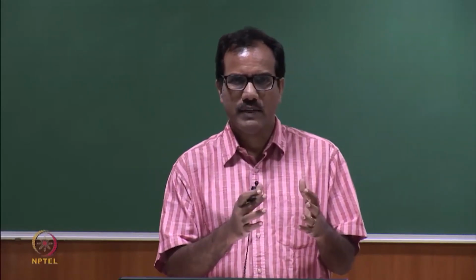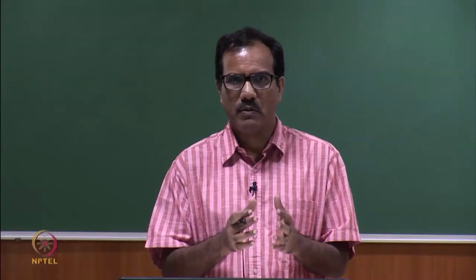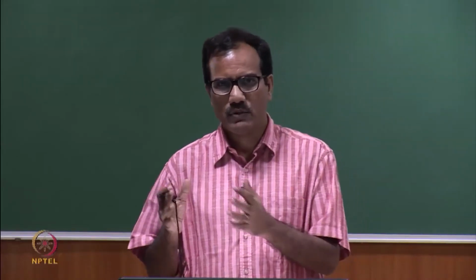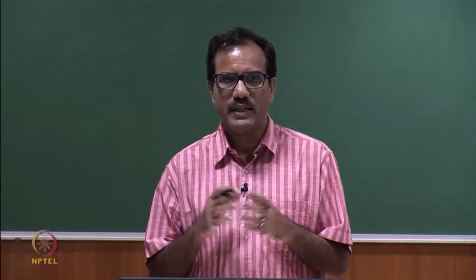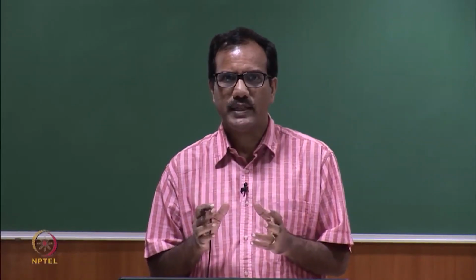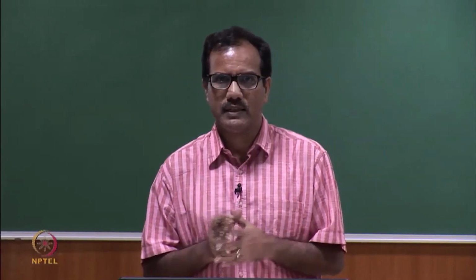So, if I want to get not only the fluorescence lifetime, but also the decay shape, it is very difficult to get it from a single excitation emission cycle.